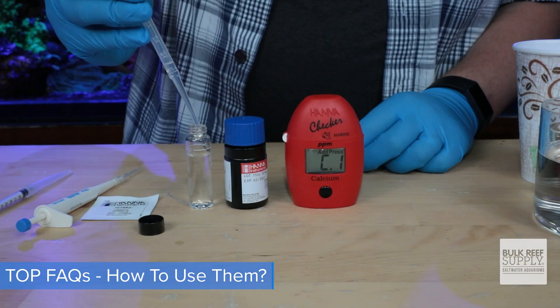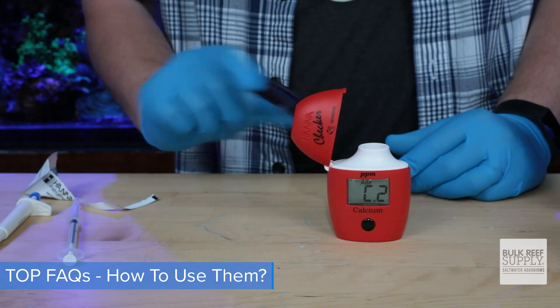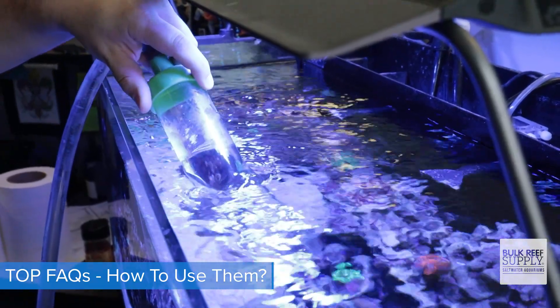Press the button, fill the cuvette, wipe it clean, and put it in the tester. Press the button, remove, add your reagent, shake or mix as per the directions, wipe again, and press the button. And it's like magic — there's no color matching, counting drops, calculations, or anything extra needed, except maybe a large water change depending on your phosphate results.